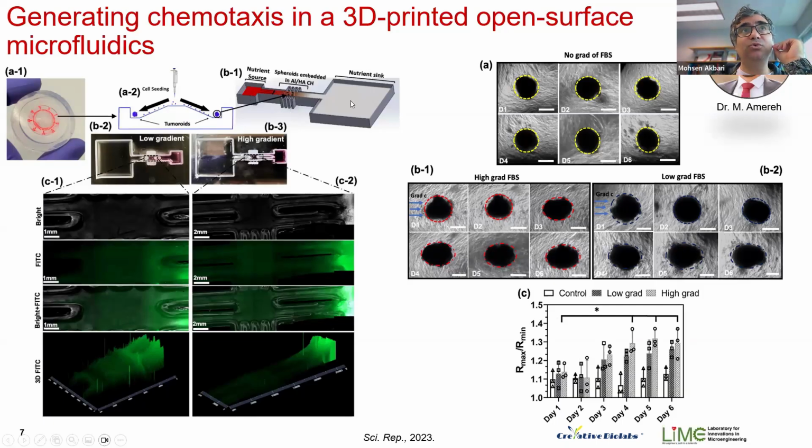And then when you add a protein or a molecule and the nutrient in the source reservoir, we were able to generate a gradient of this protein within the tumor chamber. And then we were able to investigate the impact of these gradients on the tumor remodeling.